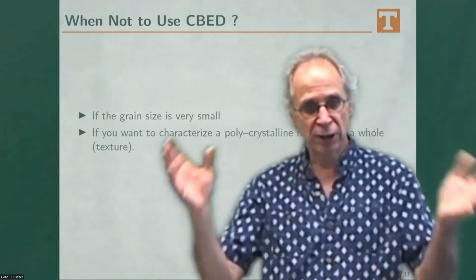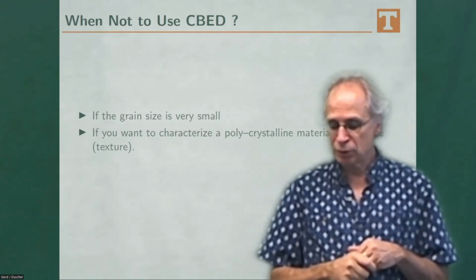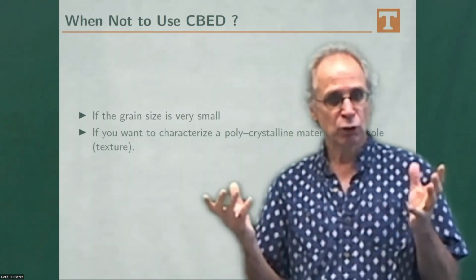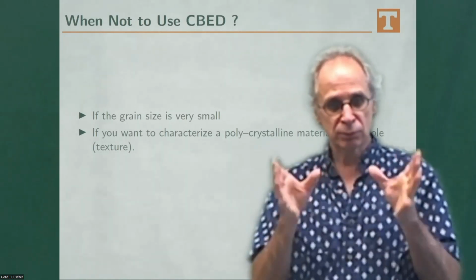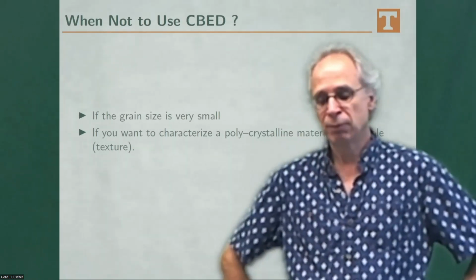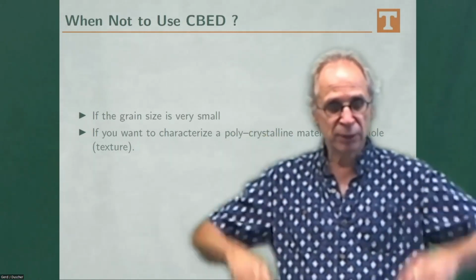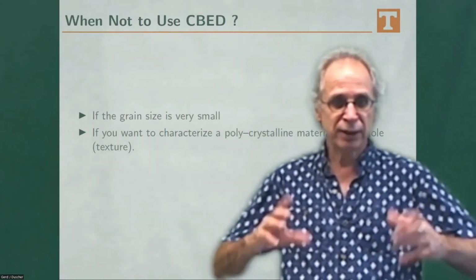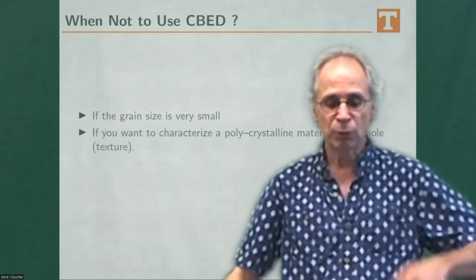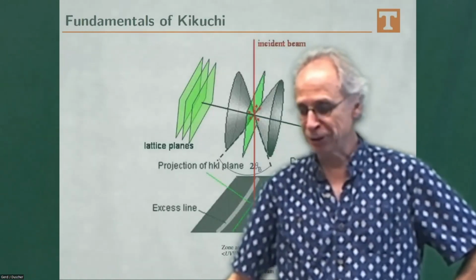If you want to use it, however, you should use it symbiotically with normal diffraction, just to check what's in there, what kind of phases, using selected area electron diffraction. In parallel illumination, your diffraction ring pattern is extremely fast and easy, so it would not be very smart not to do it, right?